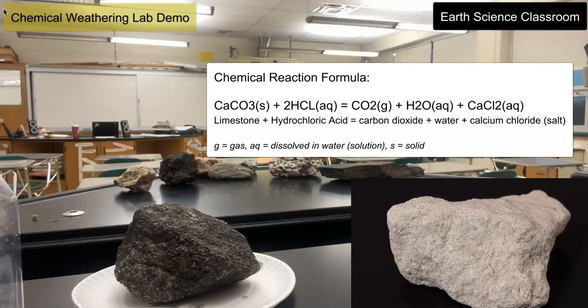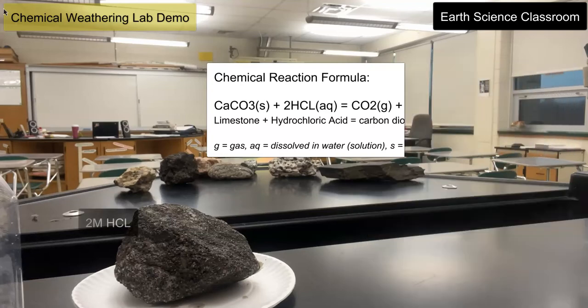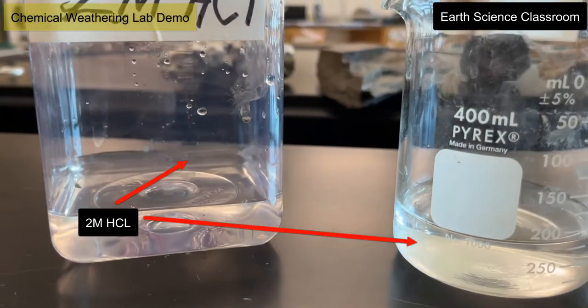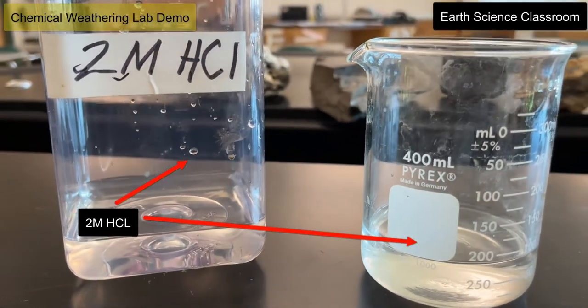This relates to reality where rainwater and meteoric water is slightly acidic, and over a long period of time this same reaction can happen, but obviously very slowly and in smaller amounts. So a quick demo and a quick close-up of what happens when you drop a limestone chip into a bath of two moles of hydrochloric acid.